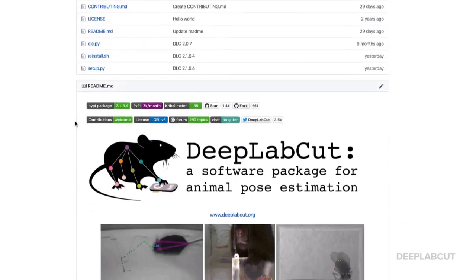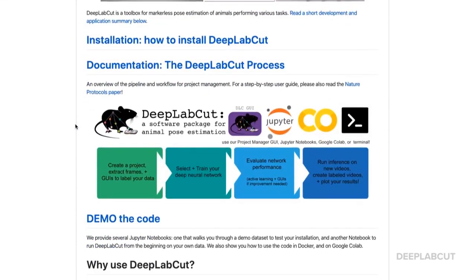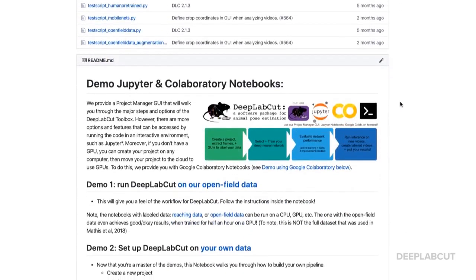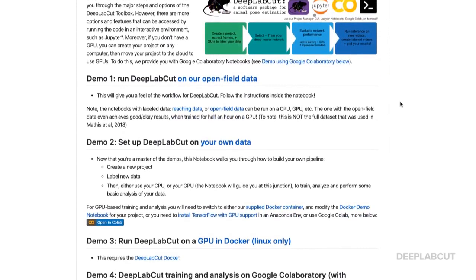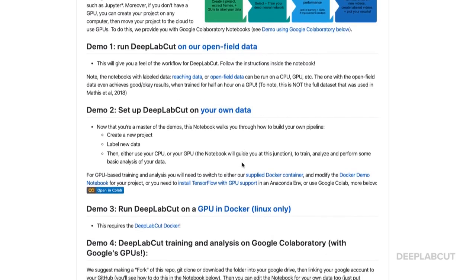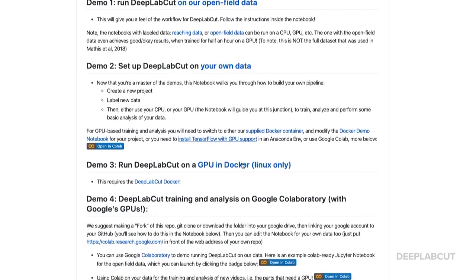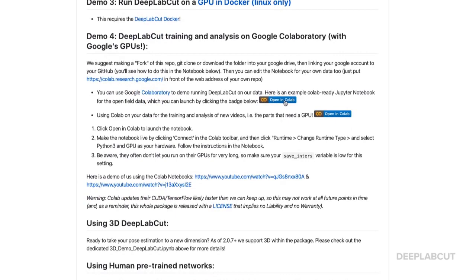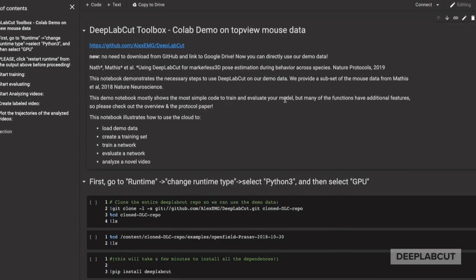Today we're focusing on navigating the documentation. So let's look at other options, namely the demo code. Here you can find documentation about how to run DeepLiveCut on the demo data we provide, setting up DeepLiveCut on your own data, and running DeepLiveCut on Colab. This is a great option to get started, because it allows you to have a no-install test of DLC.